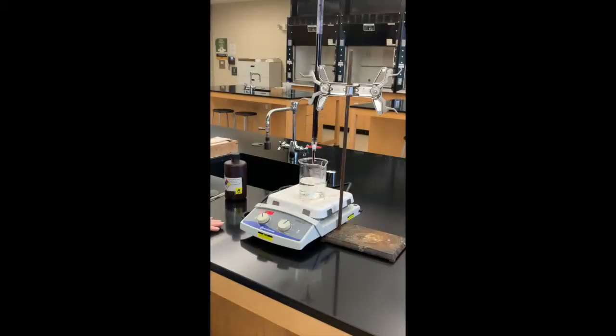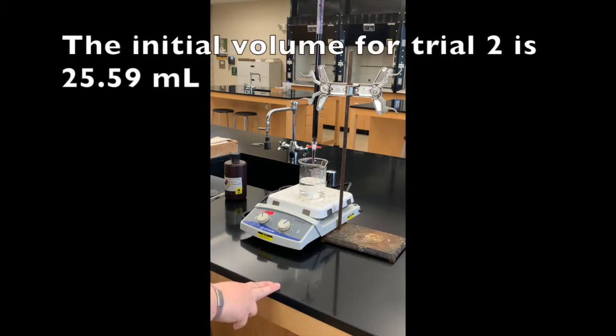The second trial of Part B is now at 60 degrees so we can go ahead and start the titration. Our initial volume for the burette is 25.59 milliliters for trial two of Part B.